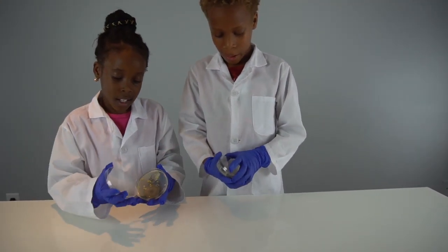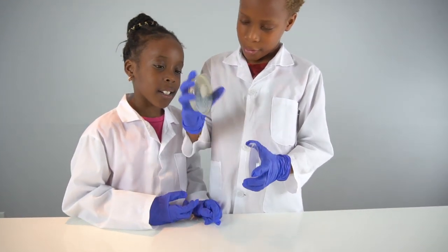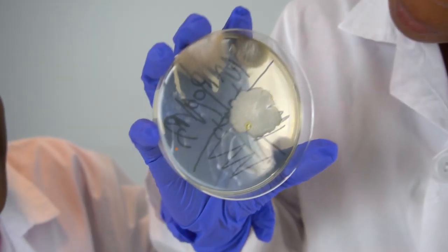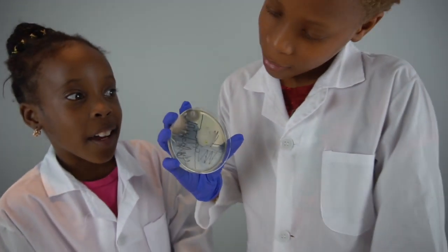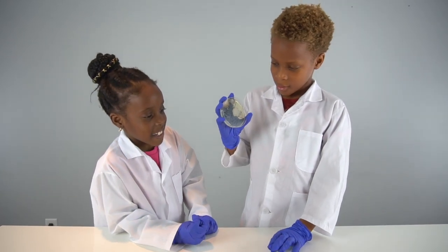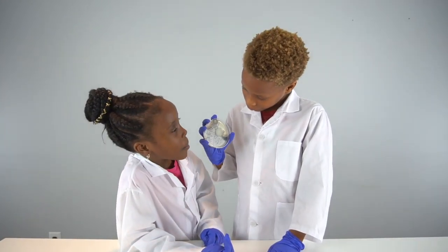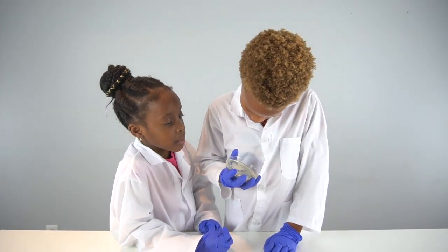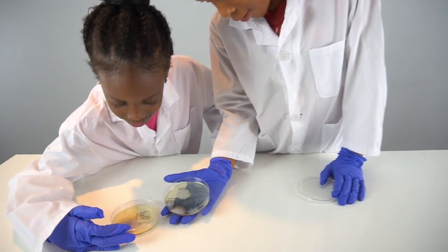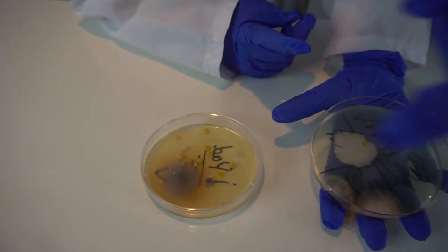Now onto my iPod pop socket, and here are the results. Mine is not that dirty because I just got it about a month ago — you got your iPod in August and your pop socket in September, and it's October now. This is so dirty! Now we can compare — yours is obviously way more dirty. Look at this giant one compared to mine. Your giant colony is bigger than both of mine combined. They all smell really bad.